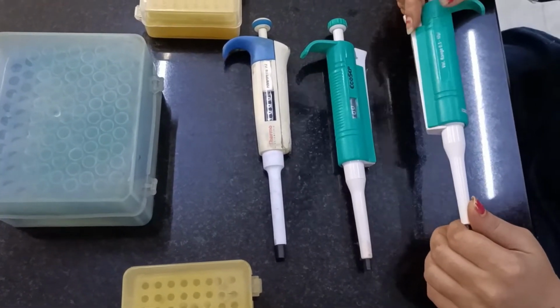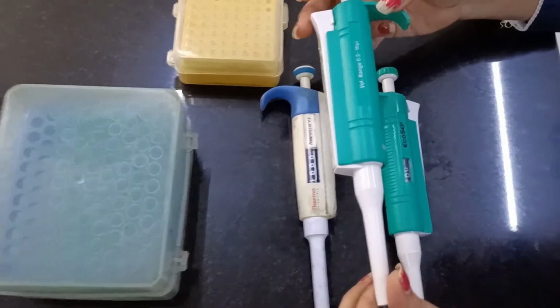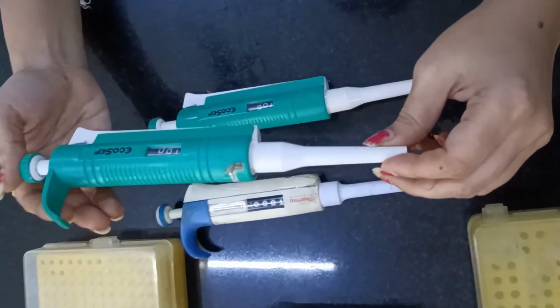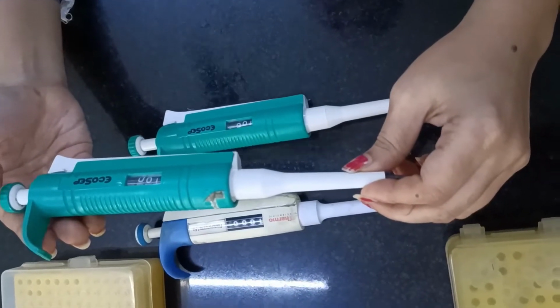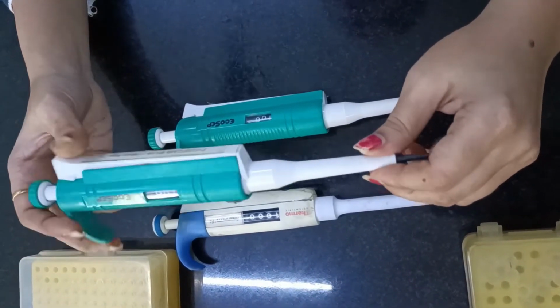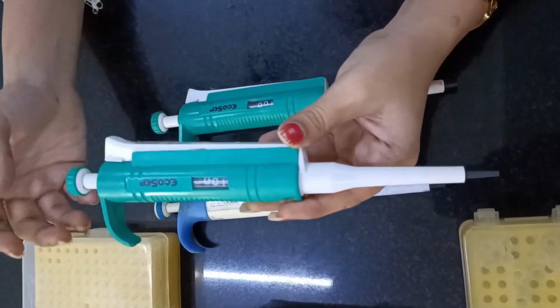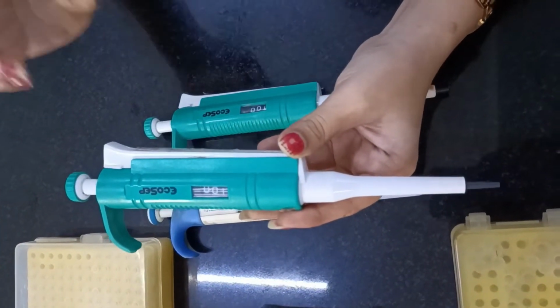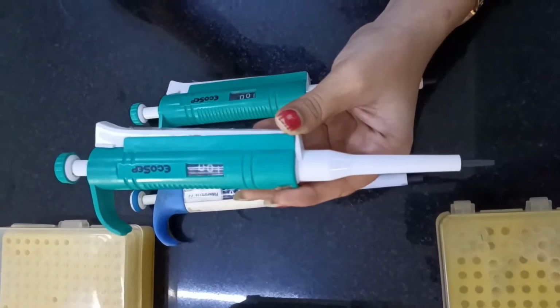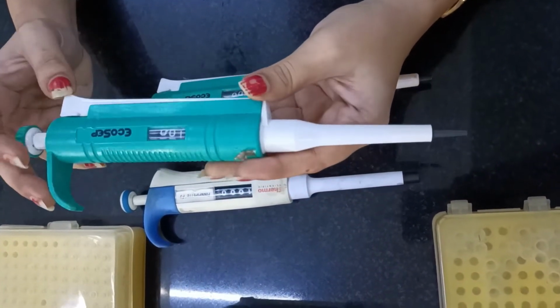Before moving ahead to how to hold the micropipette, we are going to understand what exactly the micropipettes are, what the role of each of the micro parts is, and we are going to see how exactly we are going to work it. So this is how micropipettes are. Micropipettes are the laboratory instrument which is going to take a selective volume and withdraw it from one container, transferring that particular volume from one container towards another container.